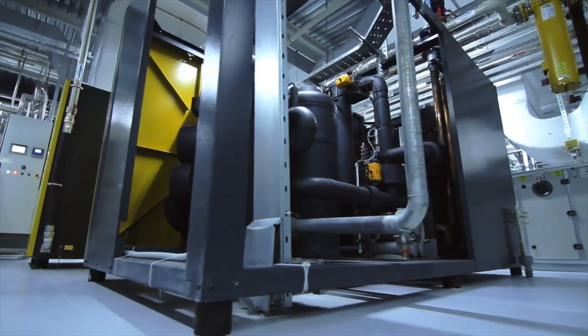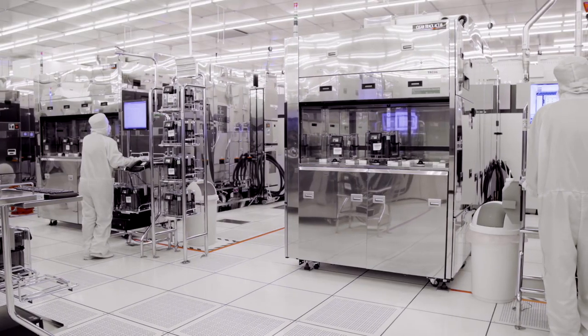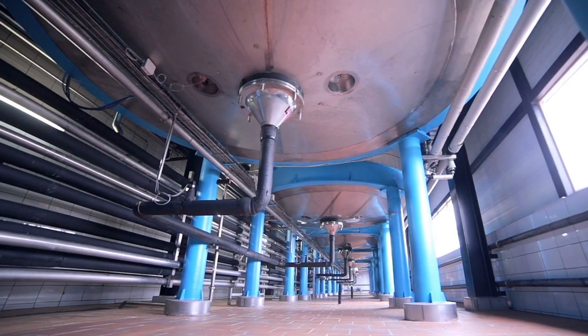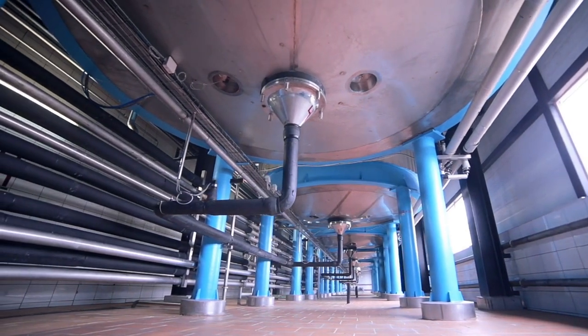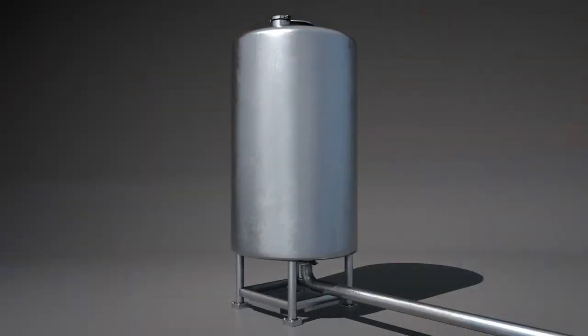Vacuum smashing bottles and cans is fun, but why is this experiment important? As we said at the start, we use steam all the time in biomanufacturing. You'll be operating and maintaining production equipment like mixing tanks and fermenters using steam-in-place systems. These vessels have to be properly vented and sterilized according to the SOP, because they have the same potential to collapse. It's hard to believe, but a 5000-liter bioreactor can collapse just like an aluminum can.